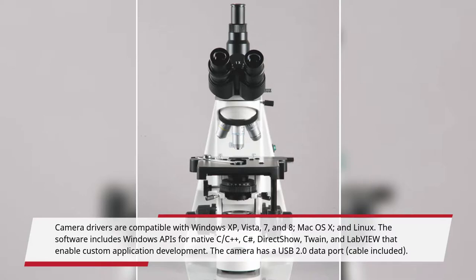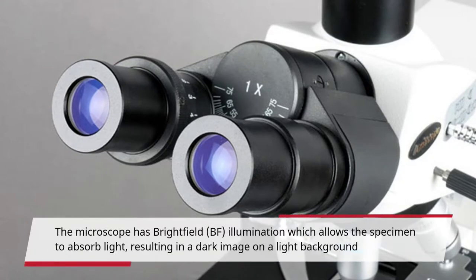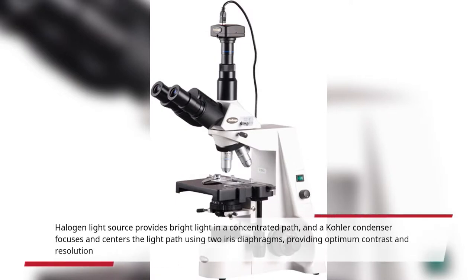The camera has a USB 2.0 data port, cable included. The microscope has bright field illumination, which allows the specimen to absorb light, resulting in a dark image on a light background. A halogen light source provides bright light in a concentrated path, and a Kohler condenser focuses and centers the light path using two iris diaphragms, providing optimum contrast and resolution.